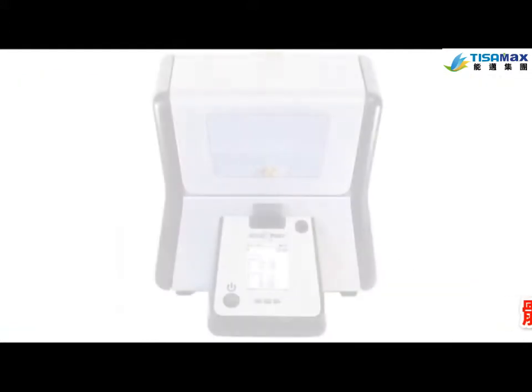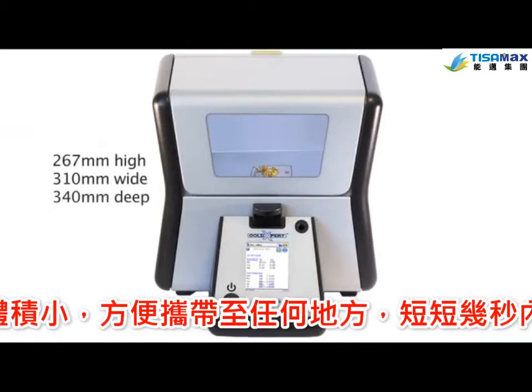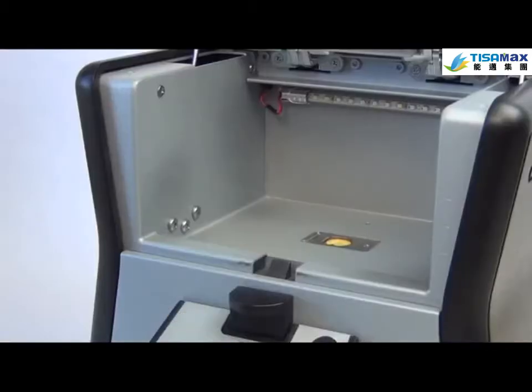The Gold Expert from Olympus was designed with the jewelry industry in mind. Its small footprint won't take up valuable counter space, and it can test any piece of jewelry in seconds. Testing couldn't be easier.